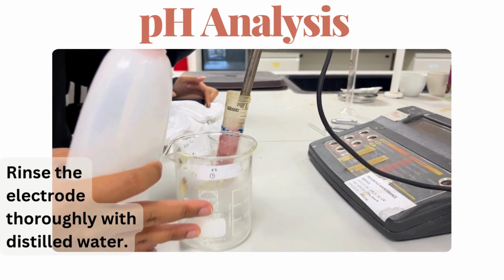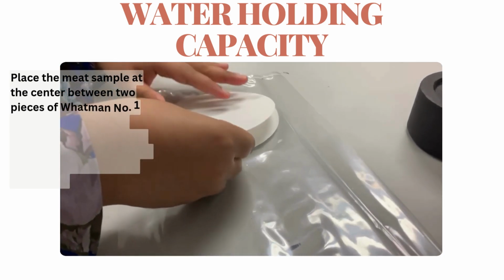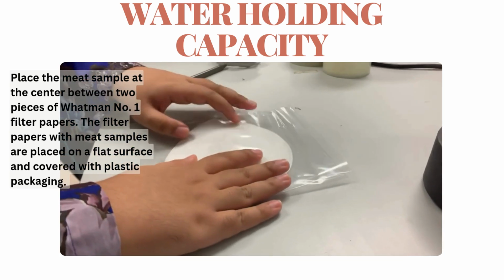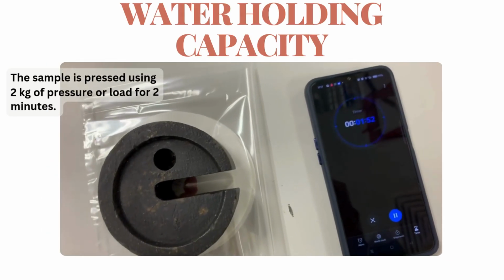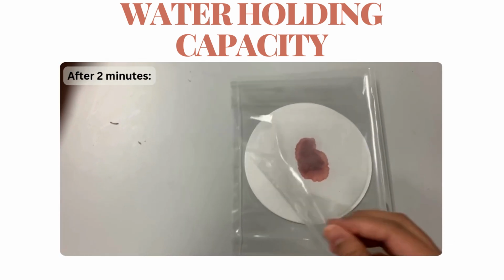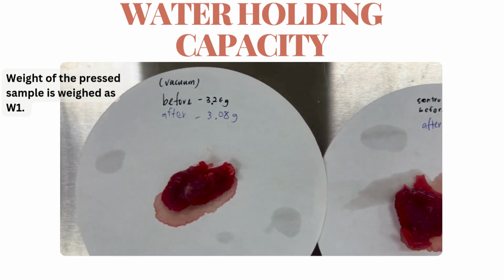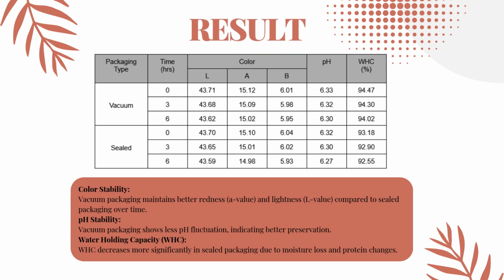Rinse the electrode thoroughly with distilled water. Place the meat sample at the center between 2 pieces of Whatman No. 1 filter papers. The filter papers with meat samples are placed on a flat surface and covered with plastic packaging. The sample is pressed using 2 kilograms of load for 2 minutes. The pressed sample is weighed as W1. Calculate water holding capacity using the following formula. The results of the analysis are shown in the table.